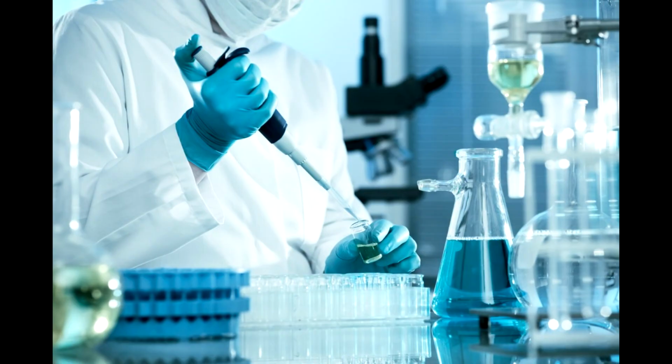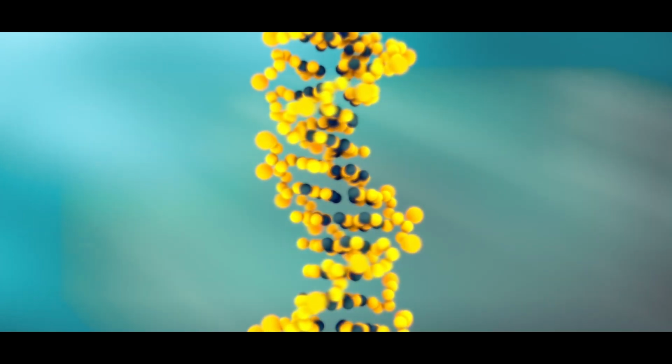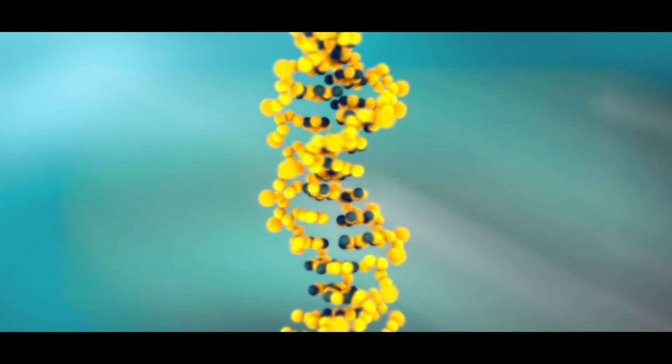DNA is used for many things, especially in the forensic science field. Although bananas may not be committing crimes, experiments like these have led us to other discoveries with our own DNA.